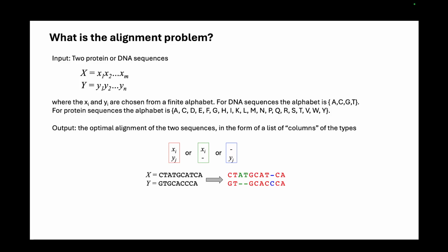in your data, but we always need a reference for an alignment. So we need a pre-constructed reference that is already there for us. There are different versions of these reference genomes. Currently the newest one is the T2T. Previously to that there was the GRCh38 reference for humans.